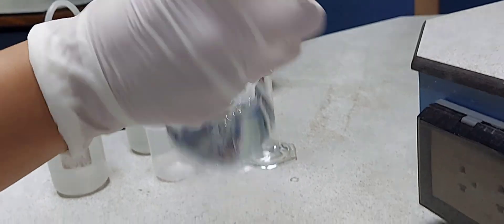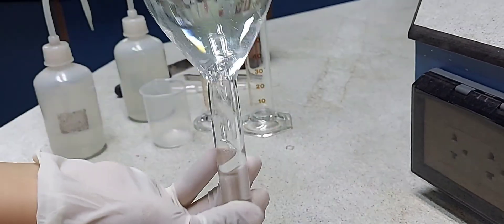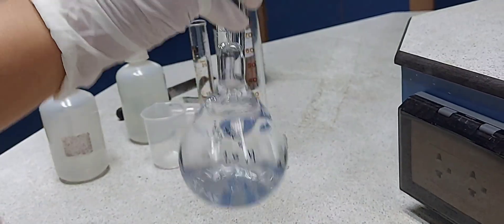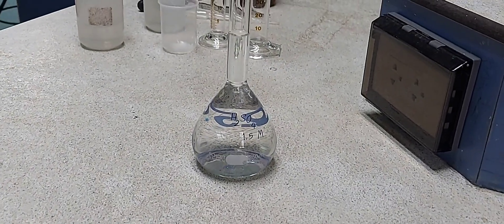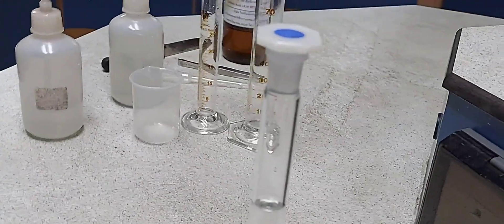And thus you have diluted the 18 molar concentrated H2SO4 to 1.5 molar H2SO4. So this is the procedure to dilute the acid.